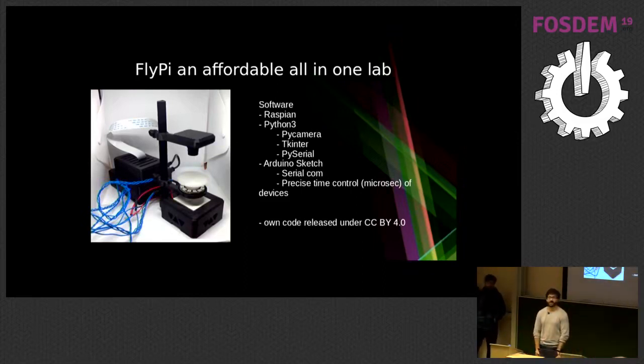Okay, one last question. How long is the image delay? Can you work with your hands and not have too much delay? Right, so the question is, what is the image delay between the camera feed and what we see on the screen? And this is really wonderful because the Pi Camera library sends everything via GPU directly, right? So there is very little, if any, delay. I could not observe any delay. So really, this is why you can focus.